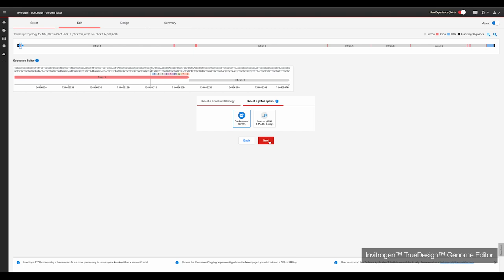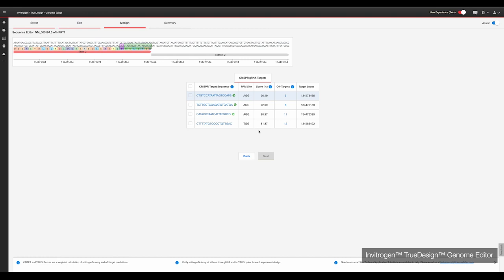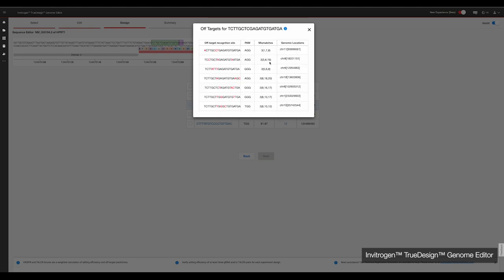Clicking next initiates True Design's algorithm, which will scan the desired edit site region for all protospacer adjacent motifs, or PAM, sequences. It will then rank the recommended gRNAs for performance and specificity, and filter out those with poor off-target prediction. If the site you are targeting lacks a PAM for CRISPR, True Design will design TALENs to target the desired edit site.